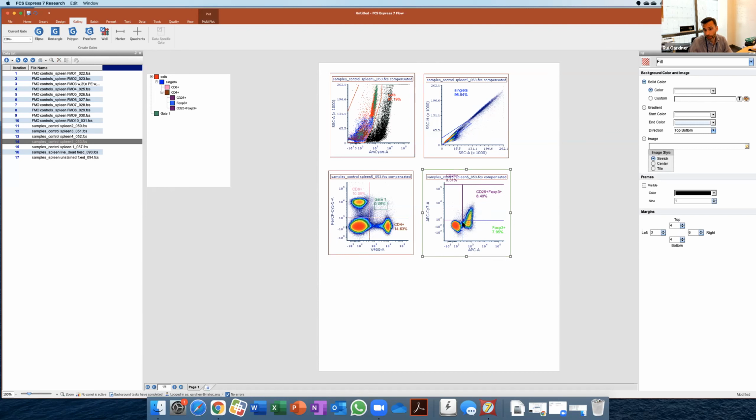And this is nice because we would expect FOXP3 and CD25 to be doubly expressed. So most likely most of these cells are actually double positive, but we can't resolve them. So this is a limitation of our panel, of our instrument. All we can say is we have at least 8.4%. Now, what is the problem with this? There isn't a problem with that. You're just not resolving as well as you would wish. But as long as you apply the same strategy, the same gate to all of your samples, it's a systematic error, and you're comparing sample to sample, right?